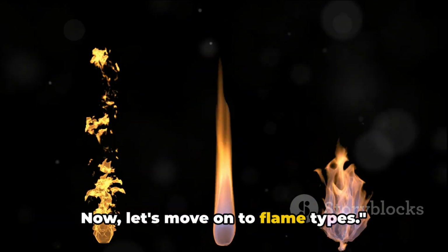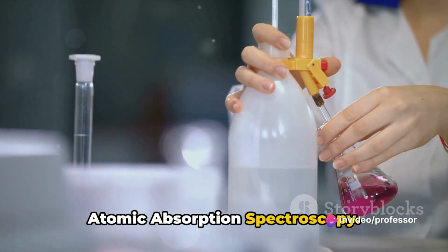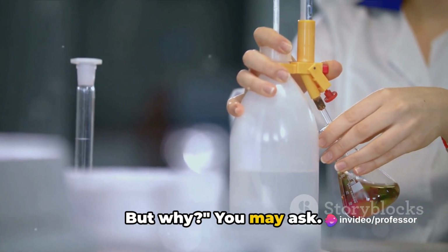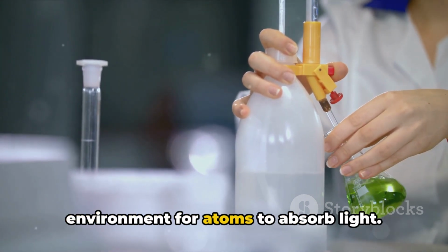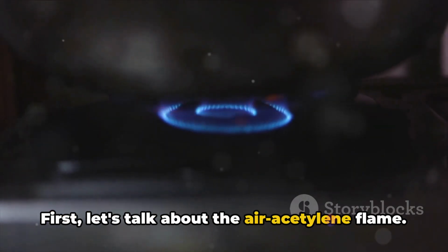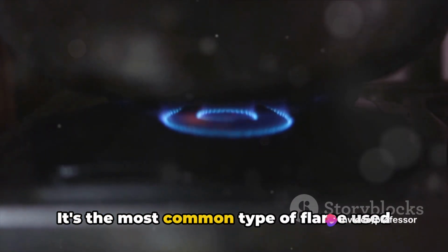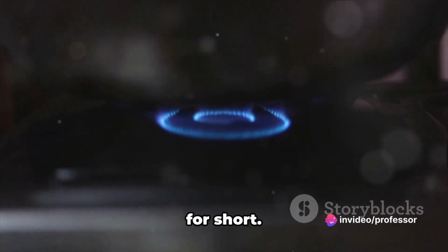Now let's move on to flame types. Different types of flames are used in atomic absorption spectroscopy, but why, you may ask? Well, it's all about creating the right environment for atoms to absorb light. First, let's talk about the air acetylene flame. It's the most common type of flame used in atomic absorption spectroscopy, or AAS for short.